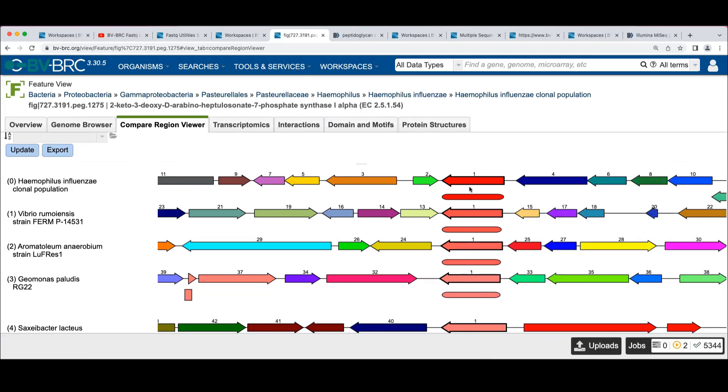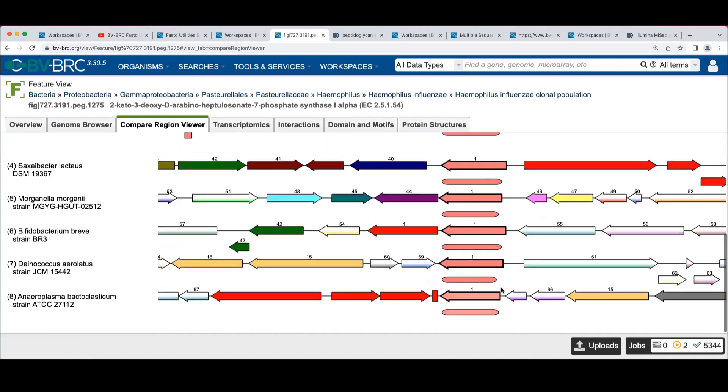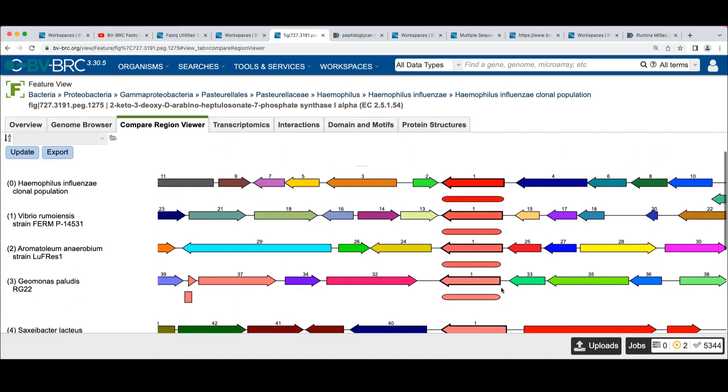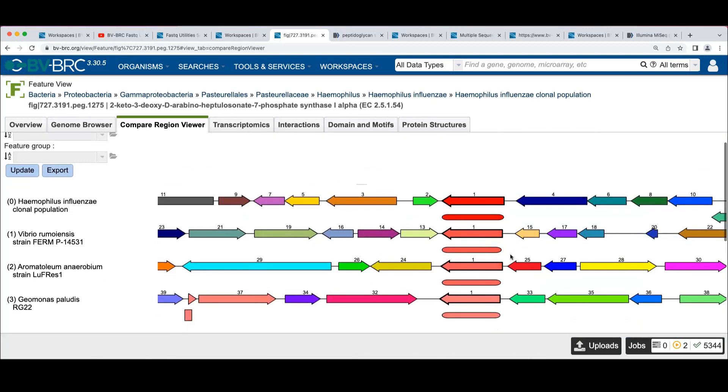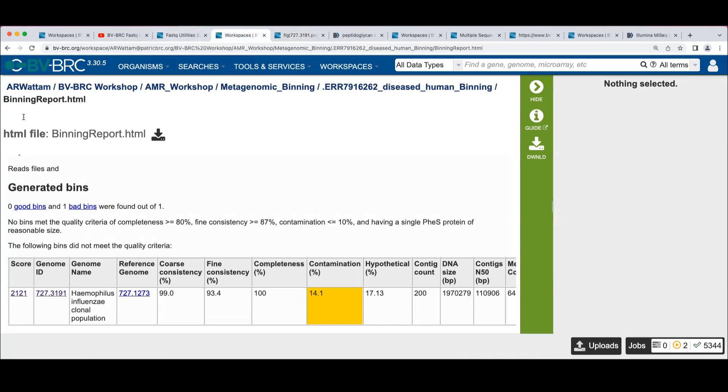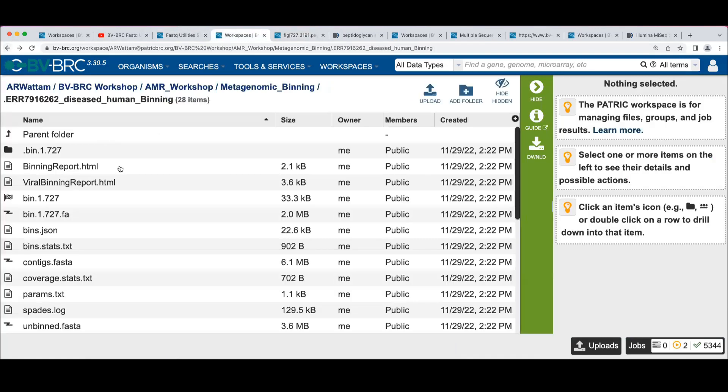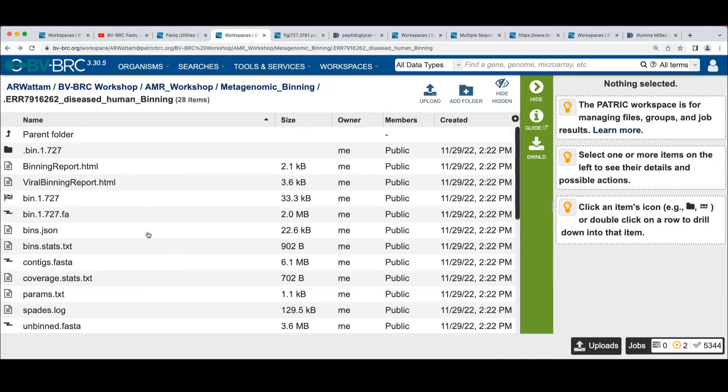And this is comparing it to instances of that gene across all the taxonomy. We see it's as long as the rest of them. It has fairly good blast similarity given that this closest one is over in Vibrio.